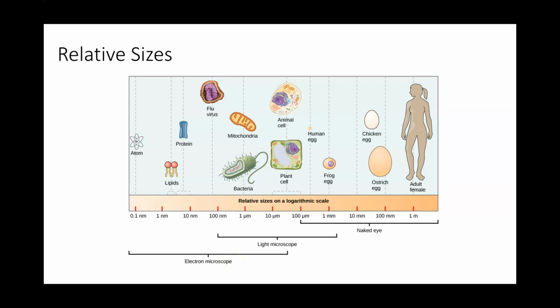So in this video, you learned the basics of an ocular micrometer and how to estimate the size of the object that you're looking at in a microscope using that ocular micrometer. Good luck on the quiz.